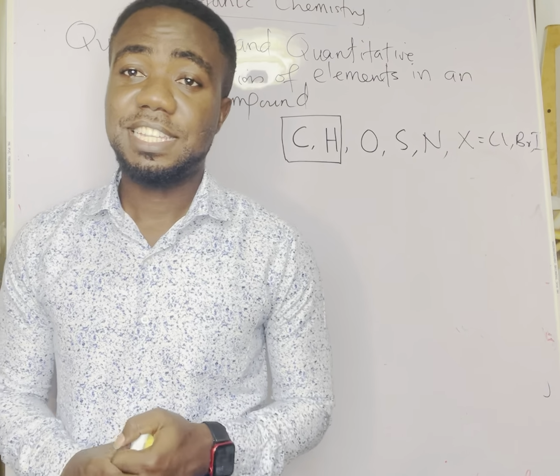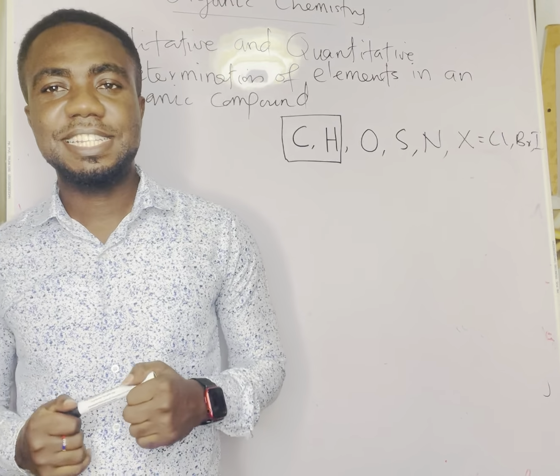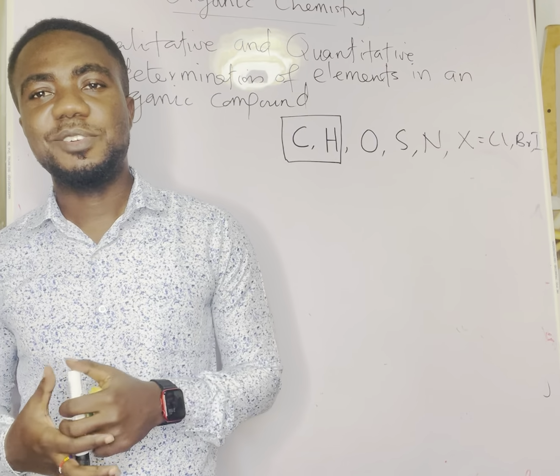Today's topic is under organic chemistry: qualitative and quantitative determination of elements present in an organic compound.